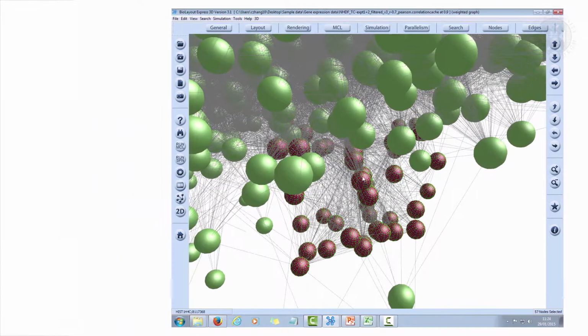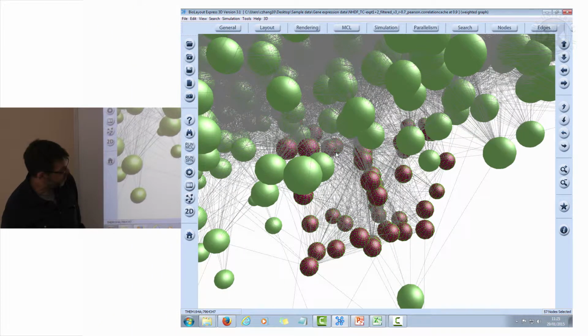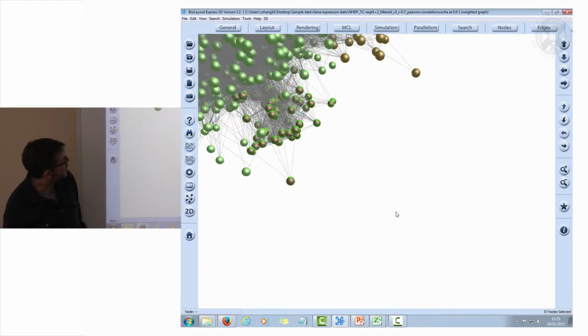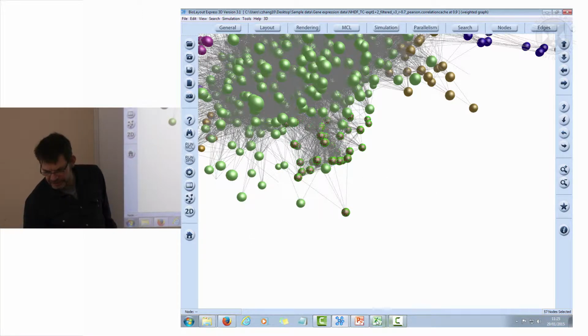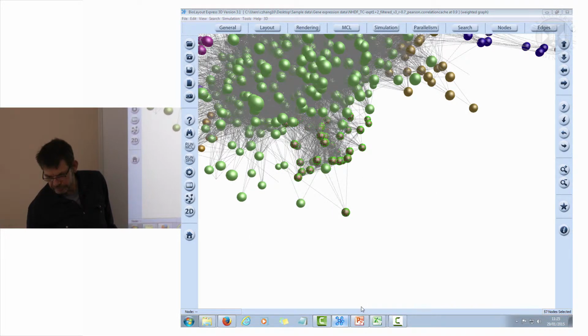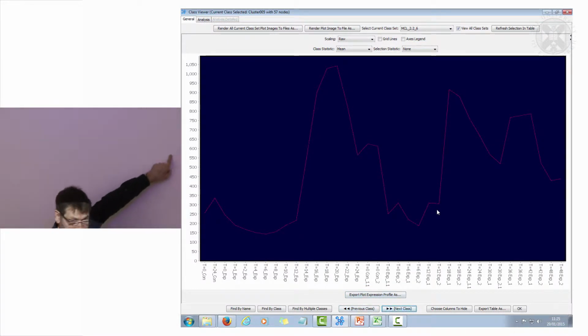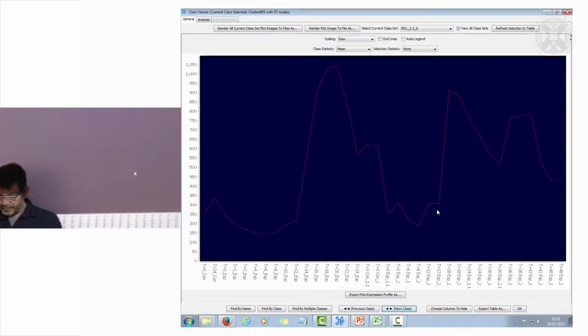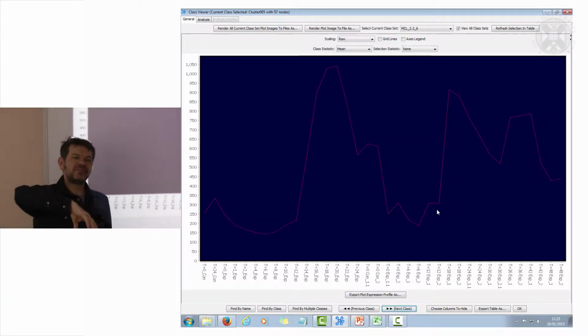Okay, see them there. They're related to what was cluster 1, the biggest cluster going up. These ones are just sitting on the side, sitting proud. So they're related to that, but they're not the same. One of the reasons is that in this second thing, they go down.